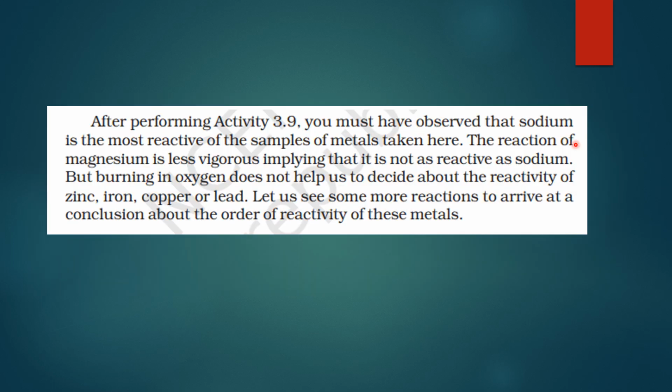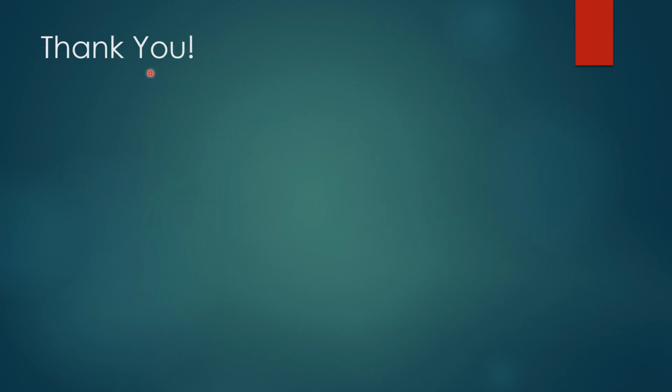We observe that sodium is the most reactive of the samples of metals we have taken. The reaction of magnesium is less vigorous, implying that it is not as reactive as sodium. But burning in oxygen does not help us decide about the reactivity of zinc, iron, copper or lead. So we will do more reactions and arrive at a conclusion about the order of reactivity of these metals.